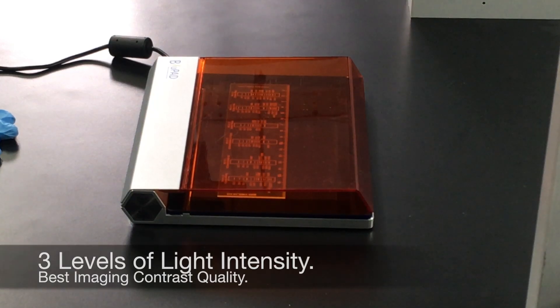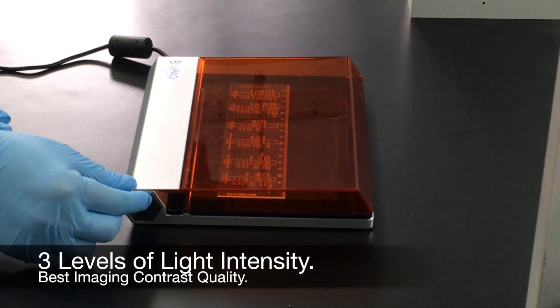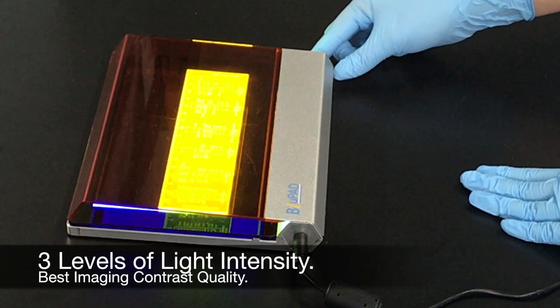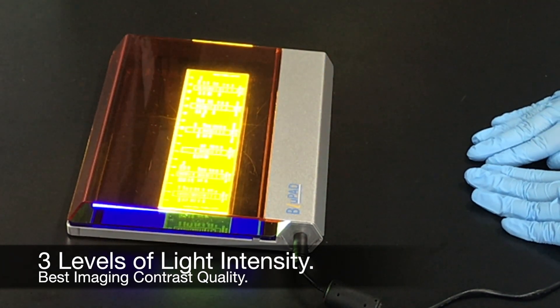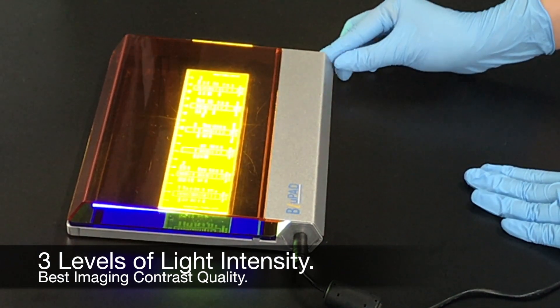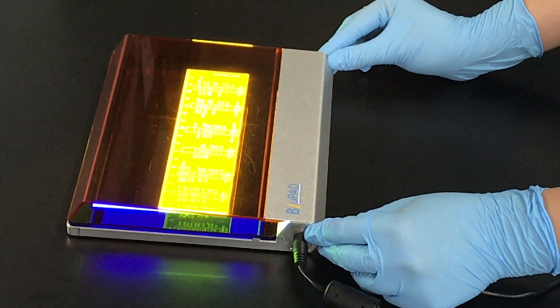The compact illumination base features a light adjustment function with three levels of intensity: low, medium and high. Further, an automatic five minutes light-off safety feature prevents the system from being overheated.